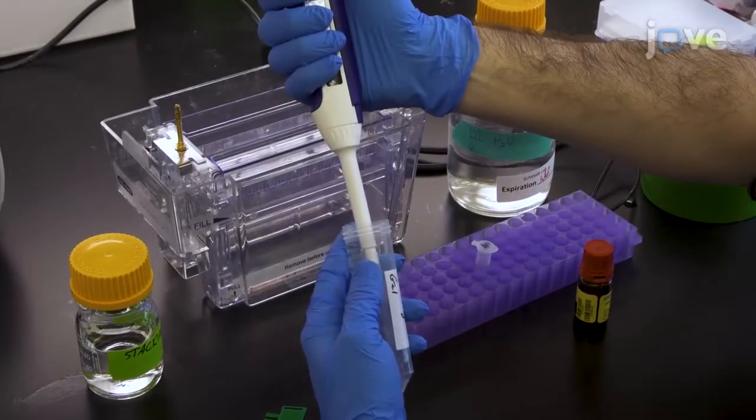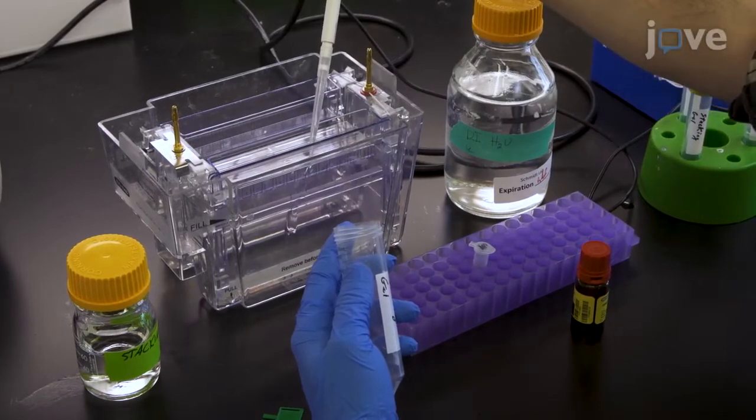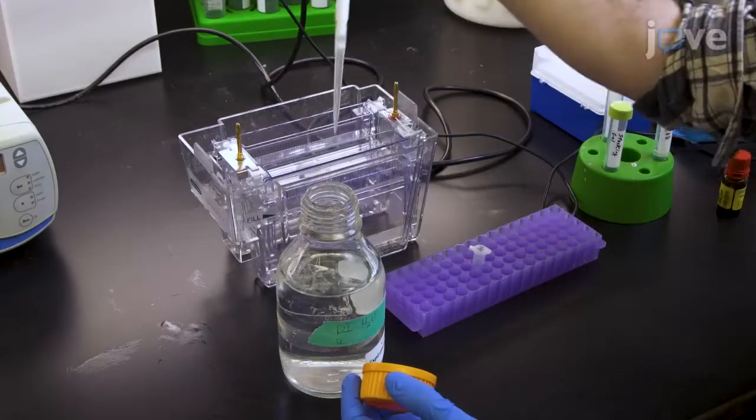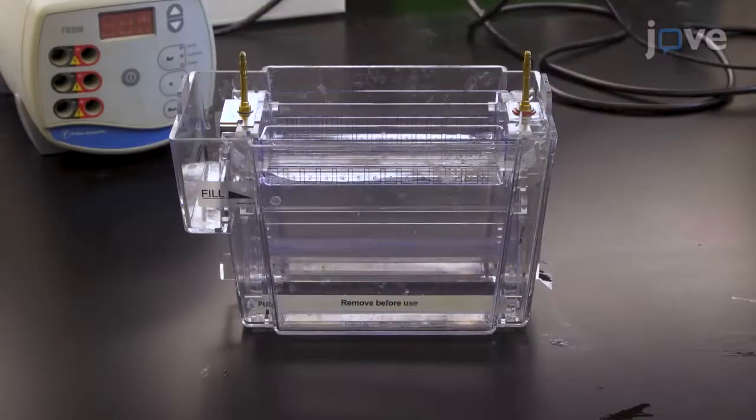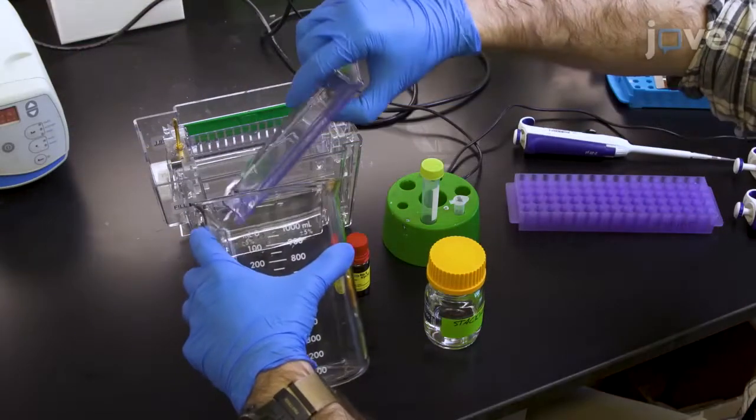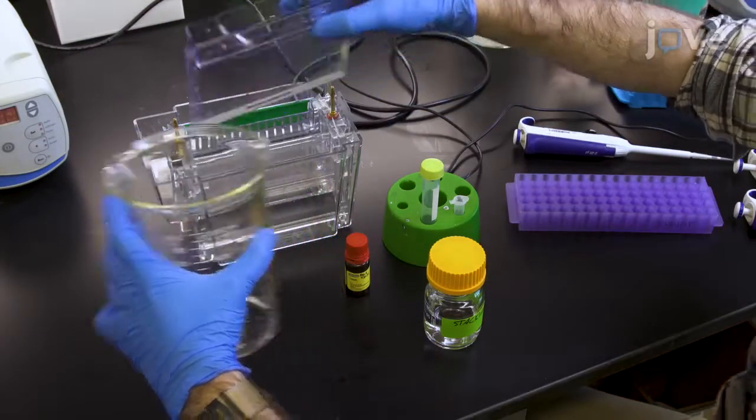Quickly add 10 milliliters of the activated polyacrylamide gel solution to the cassette using a pipette. Overlay with 2 milliliters of deionized filtered water and allow the resolving gel to polymerize for 30 minutes. After the resolving gel has fully polymerized, discard the overlaid water.